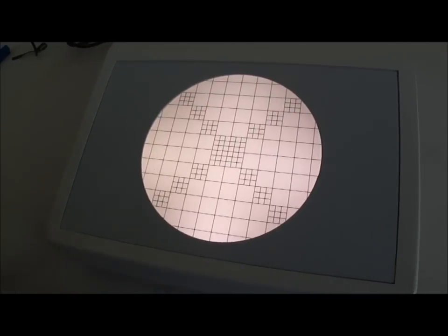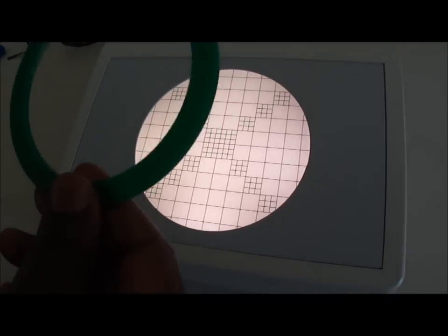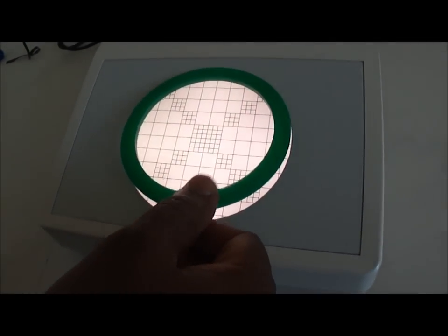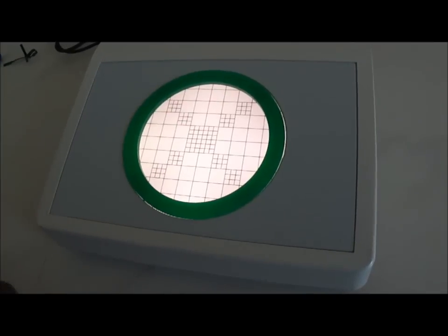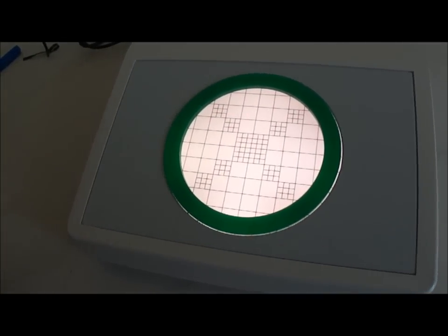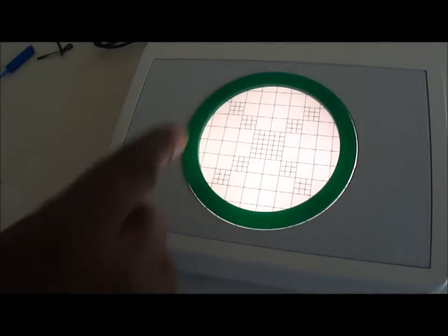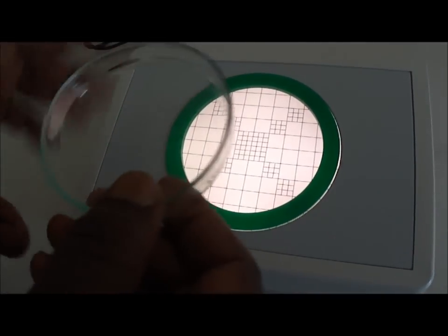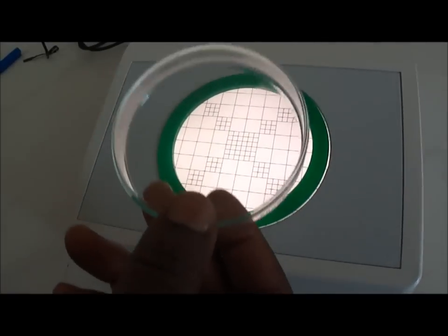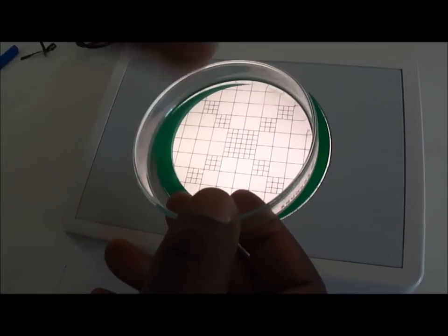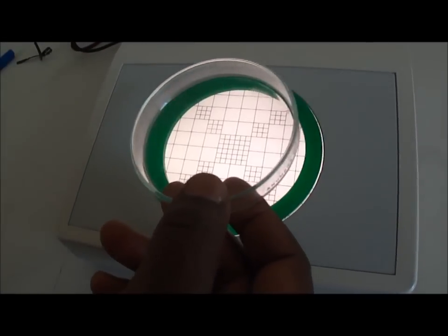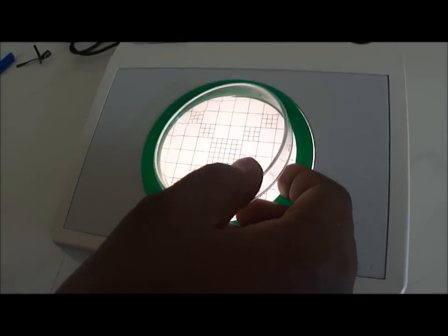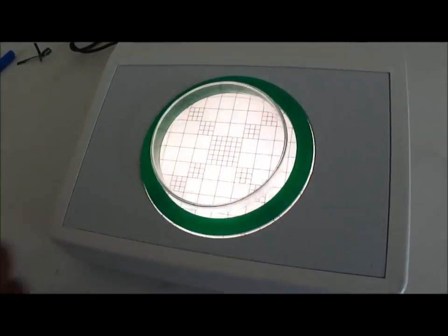And you have a ring that will be put inside the plate, and this ring, the role is to maintain in position the petri dish that will contain your agar with the bacterial growth colonies, if you put inside.